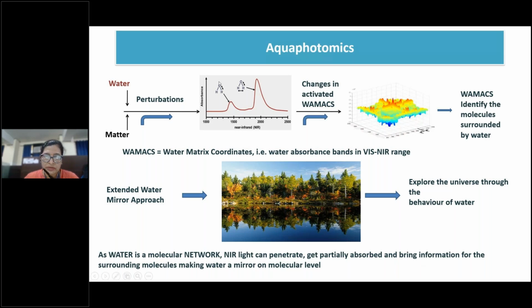This is the spectrum. From the spectra, wherever you get peaks on the specific wavelengths, these wavelengths are there for sure in the near infrared region, you can pick up the bonds. Depending upon the vibrations, because of these wavelengths, it can undergo different vibrations. For example, if you are into sciences, you might be knowing that you have symmetric vibrations. These are H bonds. Here it's O. So you can have symmetric vibrations, asymmetric vibrations, scissoring vibrations and many more. And with every vibration, water changes.